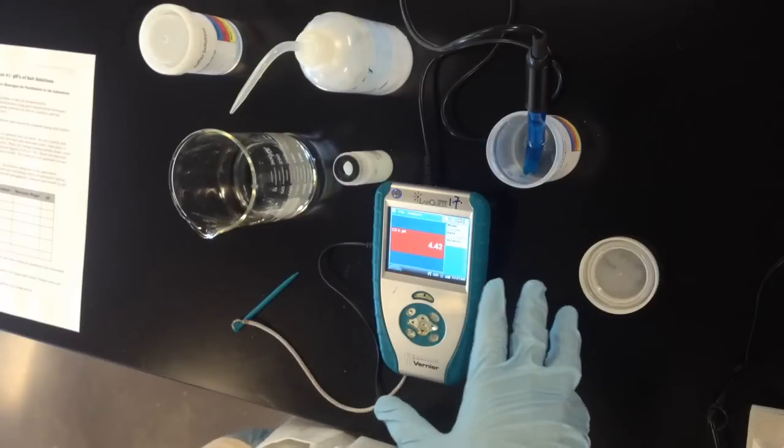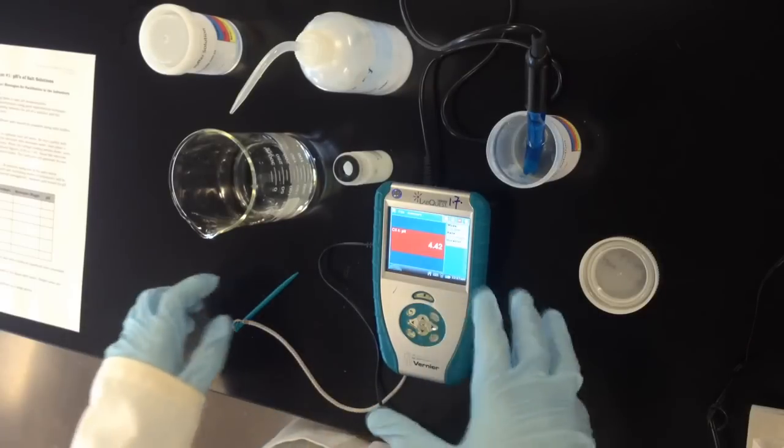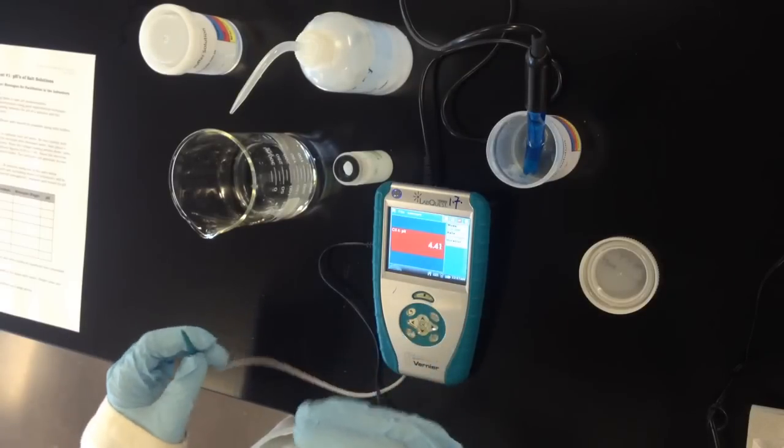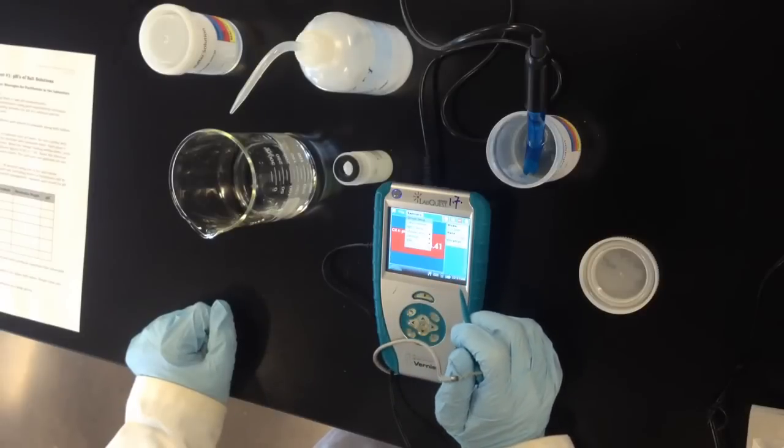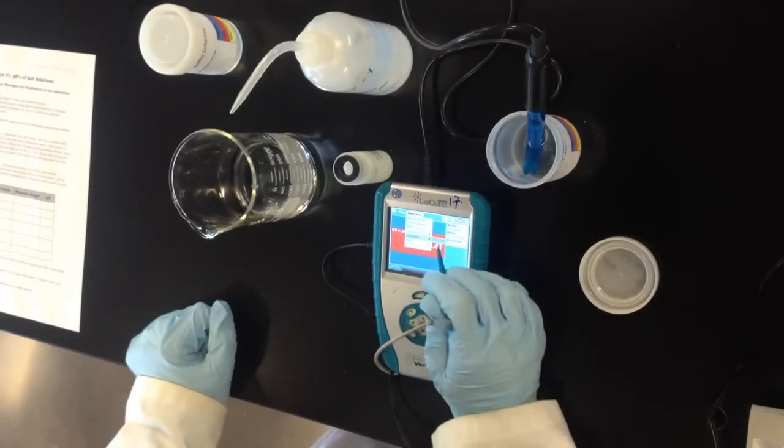You should allow the pH buffer to settle for about 30 seconds. It takes a while for the voltage there to settle. So at this point I can go to sensors, calibrate, pH.